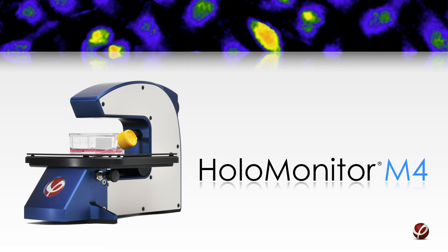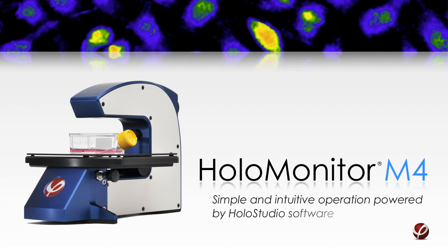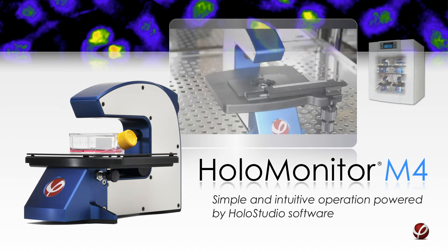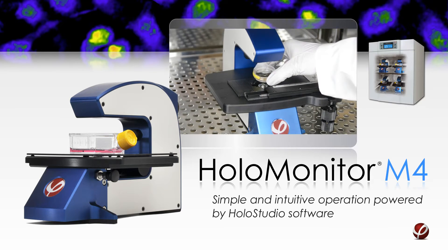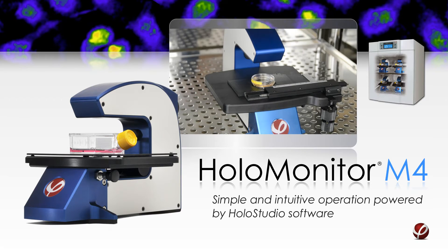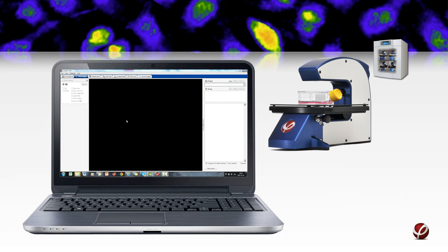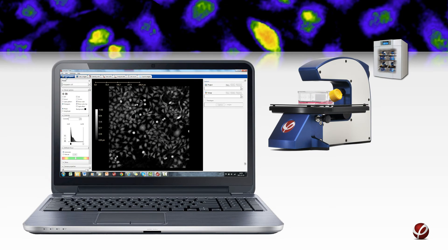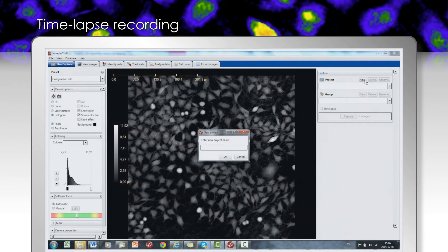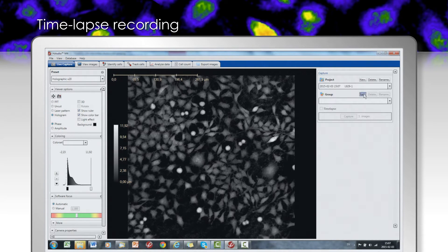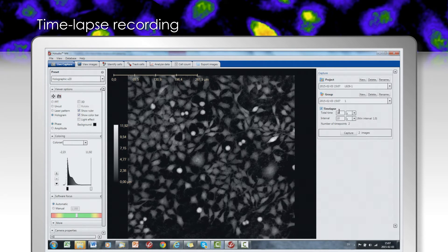Let us demonstrate the HoloMonitor M4 workflow. The operation is simple and is powered by intuitive proprietary software, HoloStudio. There are no focus or objective controls, so the only step is to position the vessel on the mechanical stage and select the field of view. The data storage features a two-tiered approach, allowing the definition of a project and separate image sequences related to the project. The total recording time and time interval between image captures are determined. Both short-term monitoring of transient events in second intervals and multi-day studies with images captured at user-defined intervals are possible.